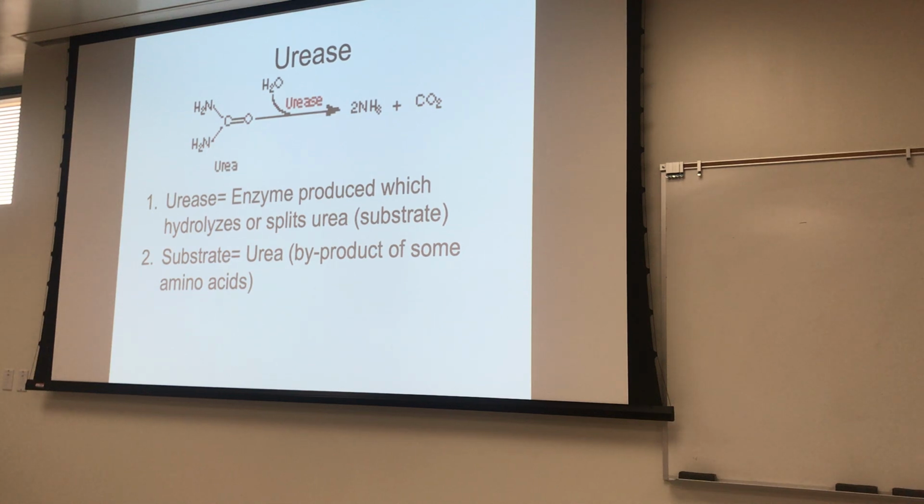The reason they created this test is because there's not too many bacteria out there that make urease. So this is actually also a pretty helpful one on the Unknown project because there's not too many examples. I'll give you guys a few though.